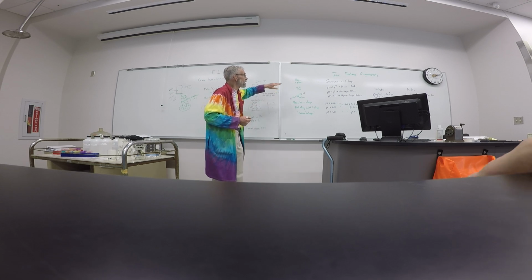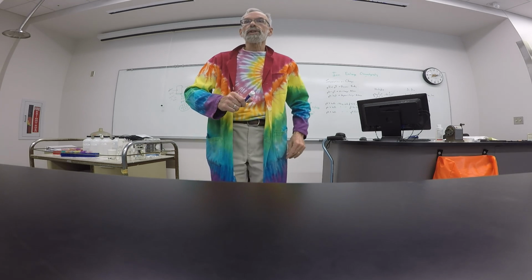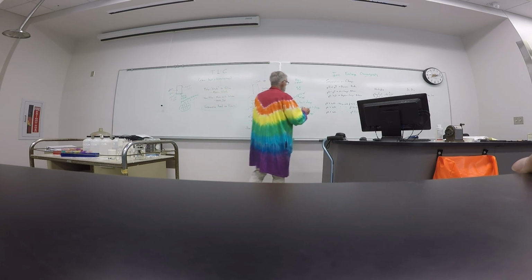But first thing we say is it's a resin. So that column in front of you is your ion exchange column. And if you look really, really close, you can see that there are tiny little beads in there. And essentially, they're tiny little plastic beads. And built into the plastic of the bead are SO3 groups. So each little bead is covered with a bunch of SO3 groups which have a negative charge.